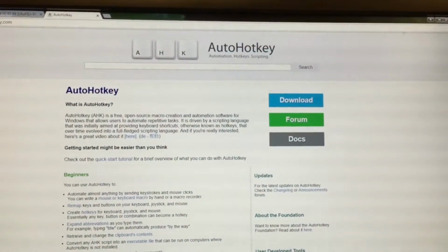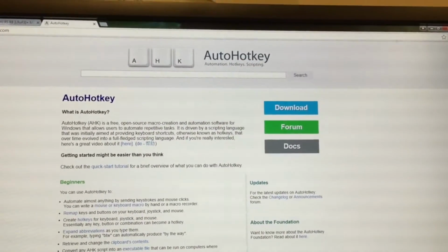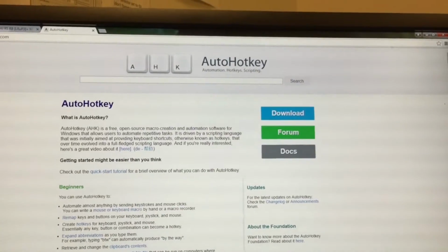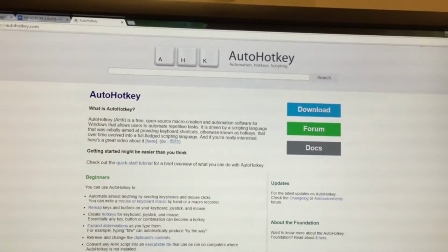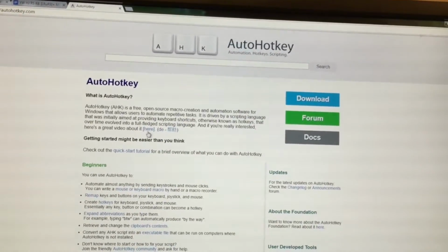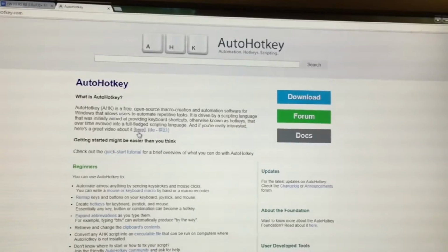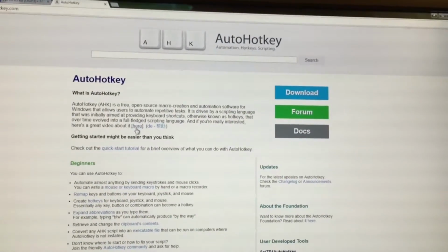In order to write an AutoHotkey script, the first thing you need to do is go to the AutoHotkey website and download AutoHotkey for free. They have a quick tutorial on what the different scripts mean. I'll let you look at it, but we just have a simple script for increasing the collision voltage gradually, and I'll show you what that is.